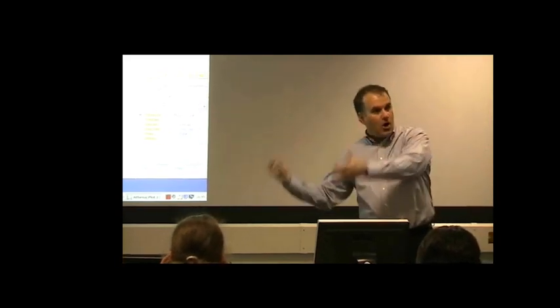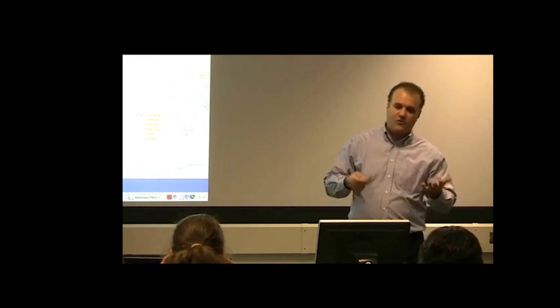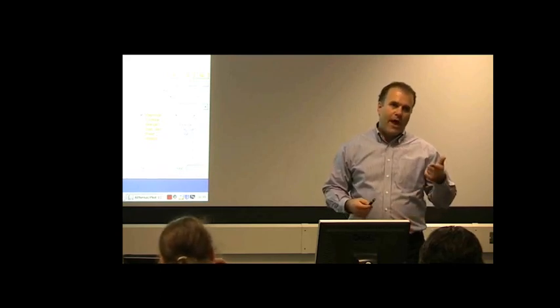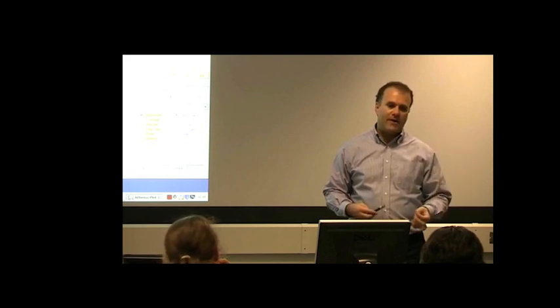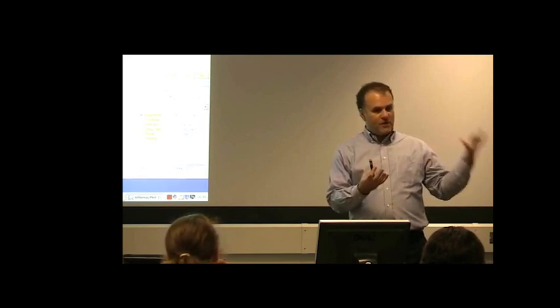So a thing to remember, and hopefully this will be helpful to you. I don't know if this kind of language will be helpful to you. But a Fourier transform is a linear transform. And the salient thing about that is that you don't change the information content of the data by going from chi of K to chi of R. You just change the representation of the data.